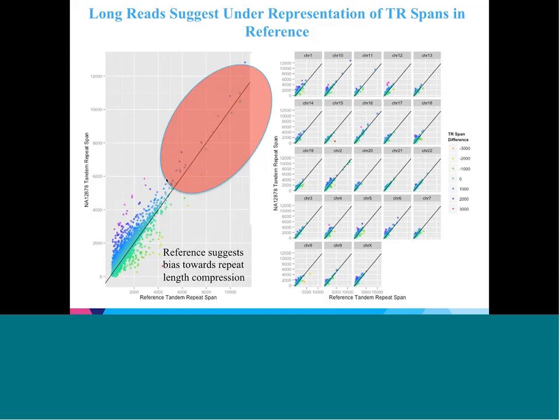also reference-based, and the concept that, for instance, if you were this point that I'm pointing out, say you were a 9,000 base pair expected reference, but you had an expansion for another 10,000 base pairs, then you would need longer read length to even represent where that point would fall. So there's also some bias there.